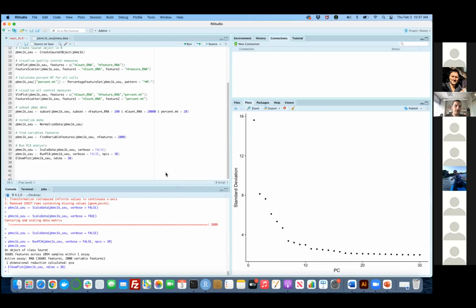The theory is quite complicated in a biological sense, but basically it's trying to figure out which of those genes are highly correlated to each other, and it's compressing those to just one dimension instead of using all those correlated ones. And then you pick the top 30, the ones that have the least correlation between each other. Is that correct? No, not least correlation. Each of these PCs represents some high number of genes that are correlated to each other, so they have the same kind of behavior. As one increases, the other increases as well. And it's just picking those up.